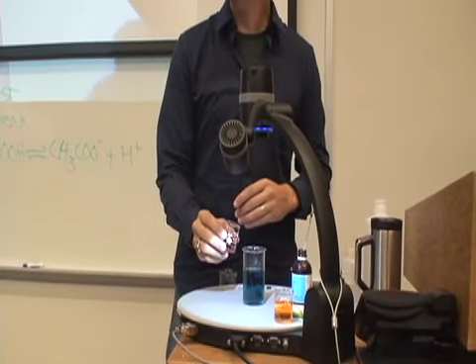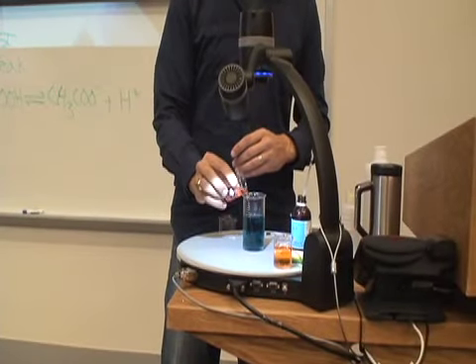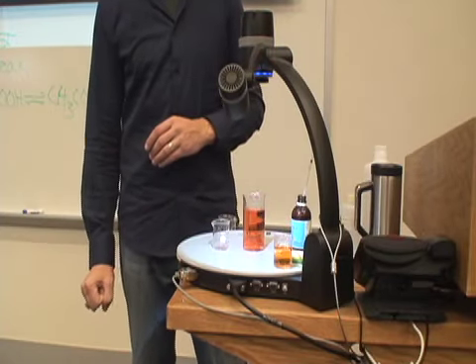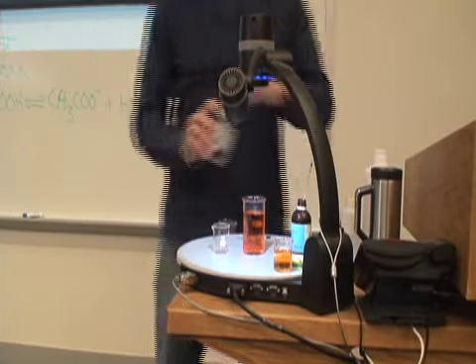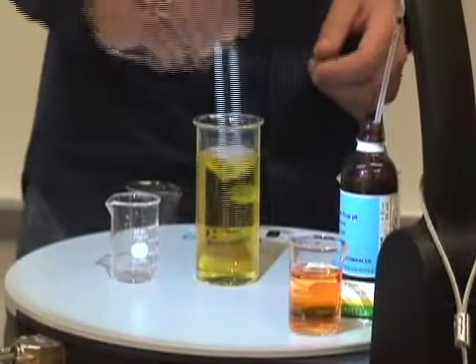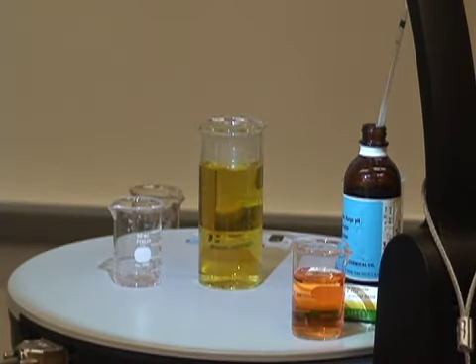What happens when I pour this vinegar in here, do you think? Might become slightly acidic. Yeah, back over the tipping point. We went back over the tipping point, didn't we? Where are we at? 7. We're lucky.